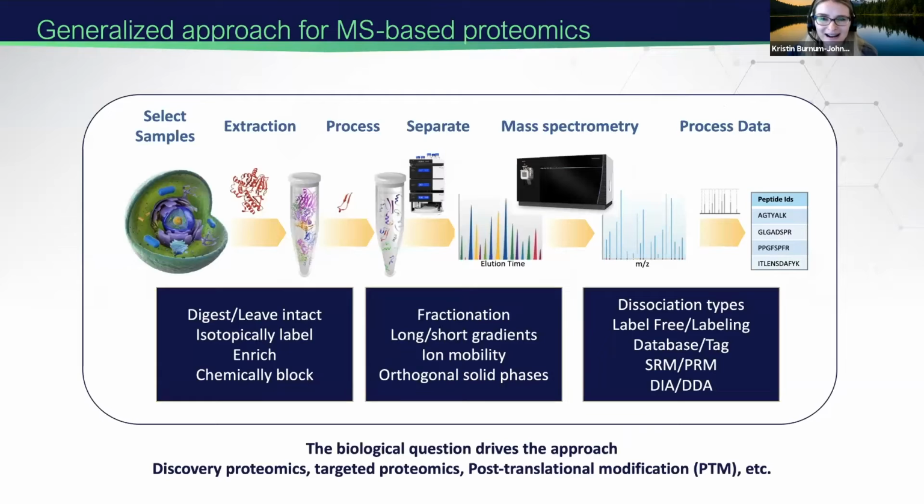Now, although I have so far emphasized bottom-up discovery approaches, I did mention that when needed to address specific biological questions, we have advanced measurement capabilities here at EMSL. So we do have additional options that you will learn about today. And as stated at the bottom of the slide, it is always the biological question that drives the approach. So following protein extraction, instead of digestion into peptides, you can leave your protein intact, or you may isotopically label your peptides for multiplex analyses or enrich a specific subset of peptides.